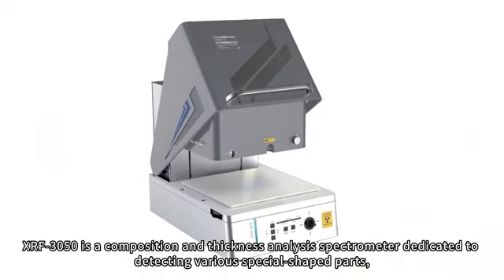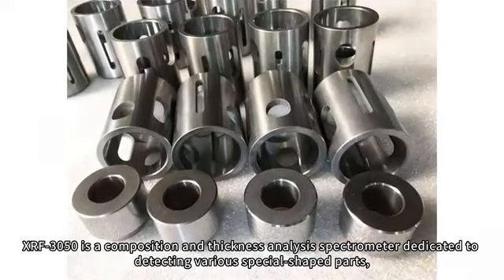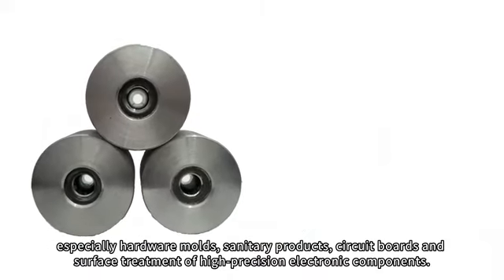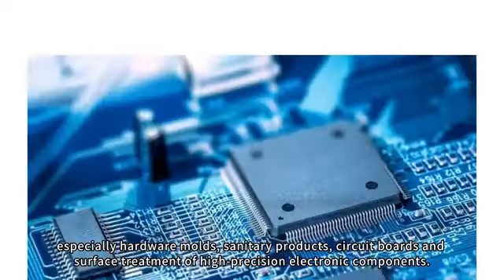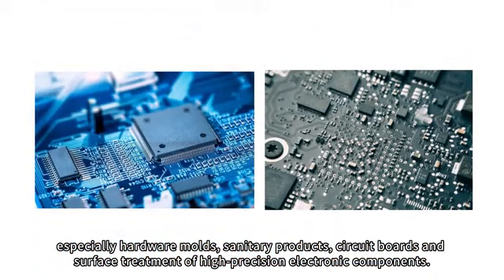XRF3050 is a composition and thickness analysis spectrometer dedicated to detecting various special-shaped parts, especially hardware molds, sanitary products, circuit boards, and surface treatment of high-precision electronic components.